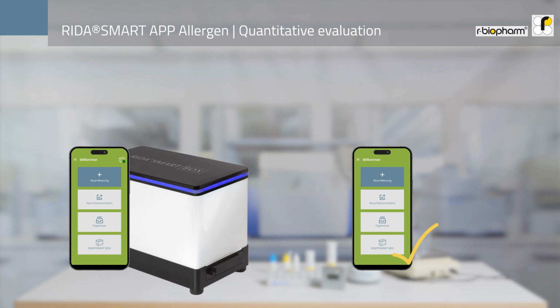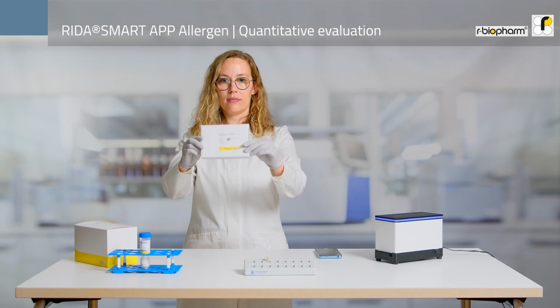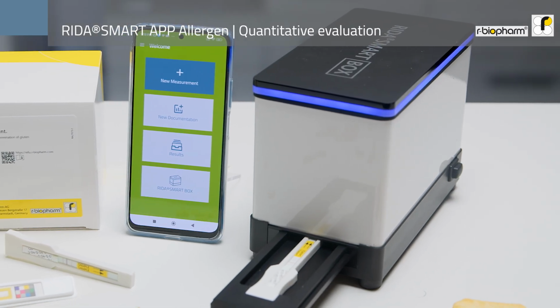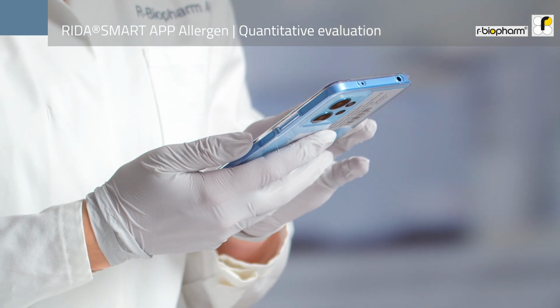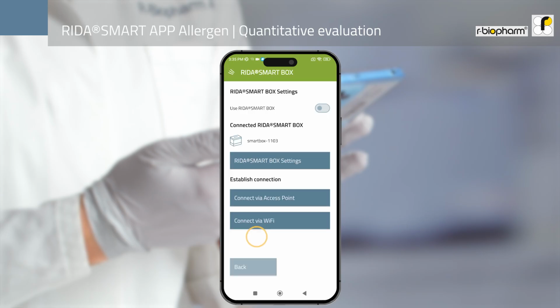The following materials are required for the evaluation: RIDA Quick Allergen Quant Test Strips, RIDA Quick Quant Evaluation Kit, RIDA Smart Box with any Android device or a verified smartphone as alternative, and the latest version of the RIDA SMART App Allergen. Via the RIDA Smart Box menu item, select whether the evaluation should be performed using the RIDA Smart Box.